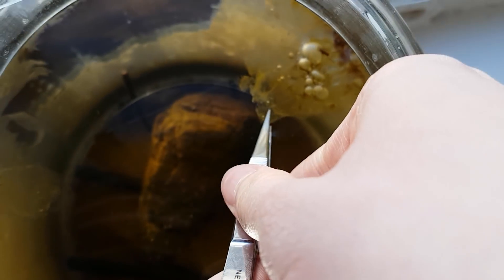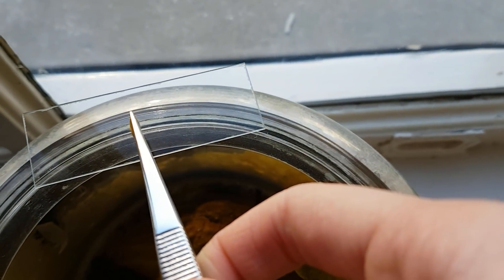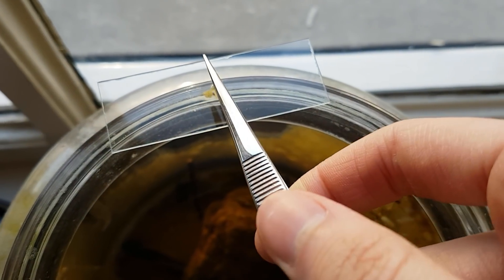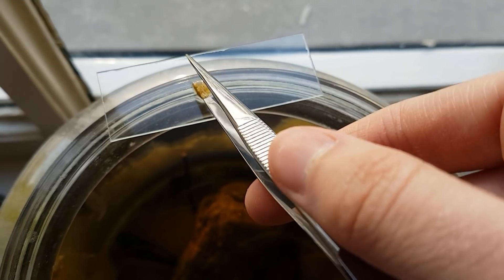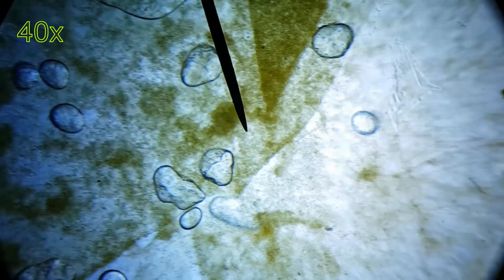Let's look at this ecosphere under the microscope. To maximize the chance of finding microbes, I'm going to take a look at this piece of algae that's been growing here for at least half a year. I prepared the microscopic slide off camera. Here you can see it at the lowest magnification.